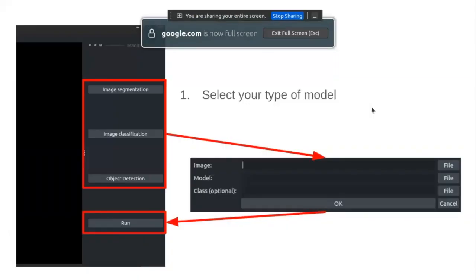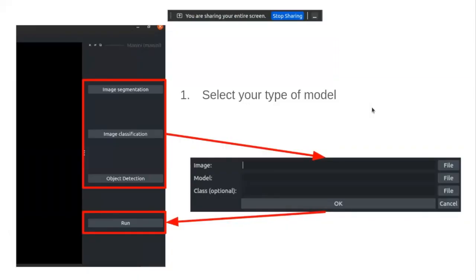Manini plugin is a tool to run the inference of three types of deep learning models: segmentation model, classification model, and detection model.